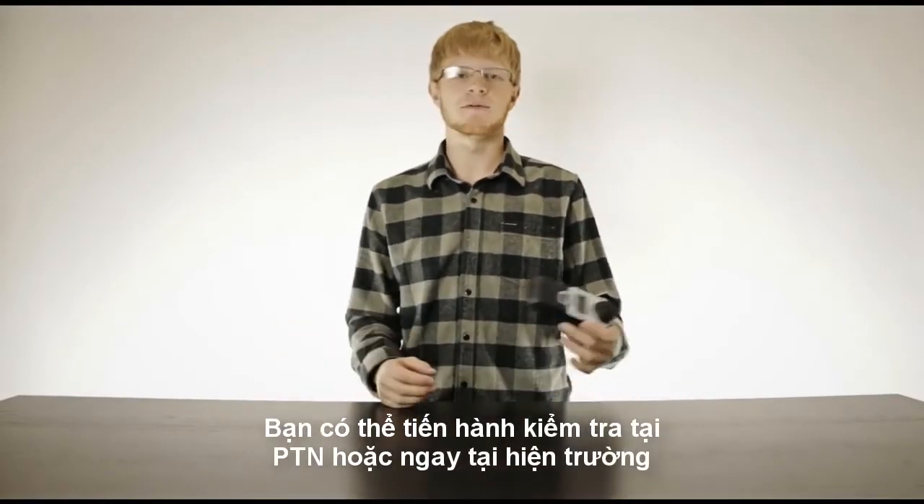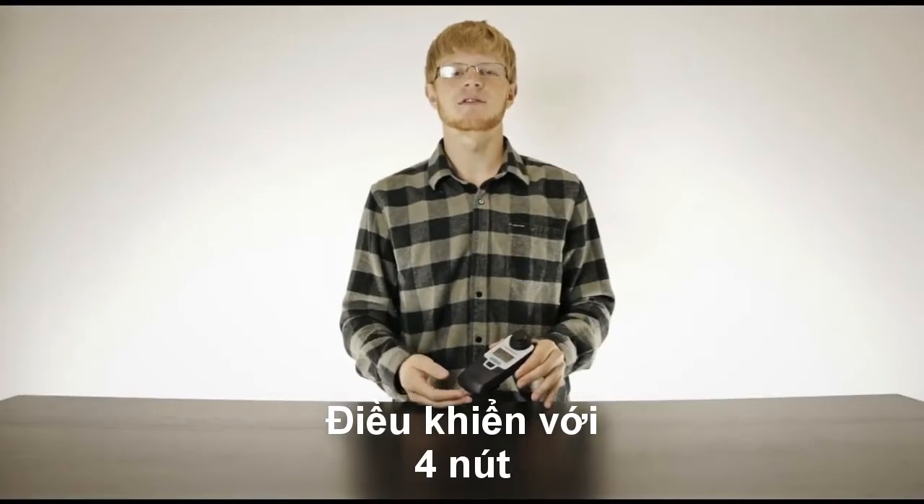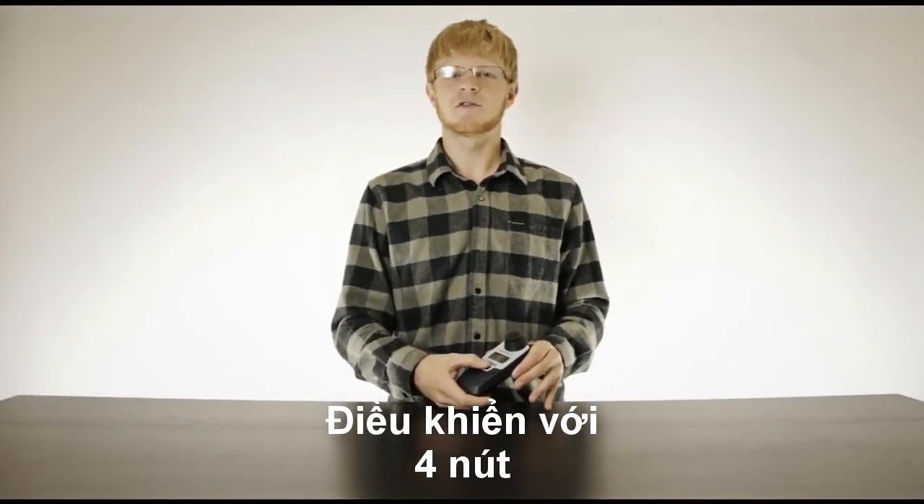Regardless of whether you're in the lab or the field, the body of the instrument is constructed from a rugged plastic and features a simple four-button interface: power on and off, a list scroll button, a blanking button, and a sample button.